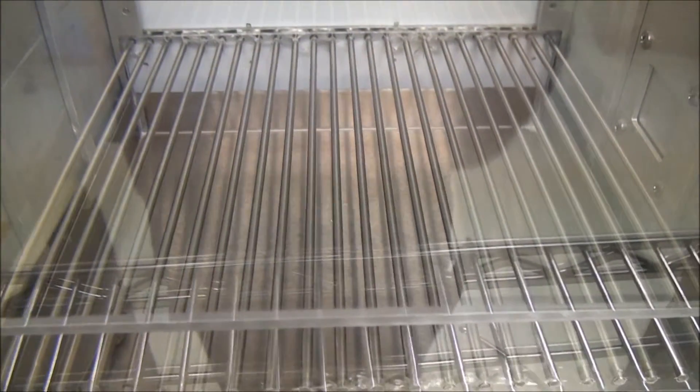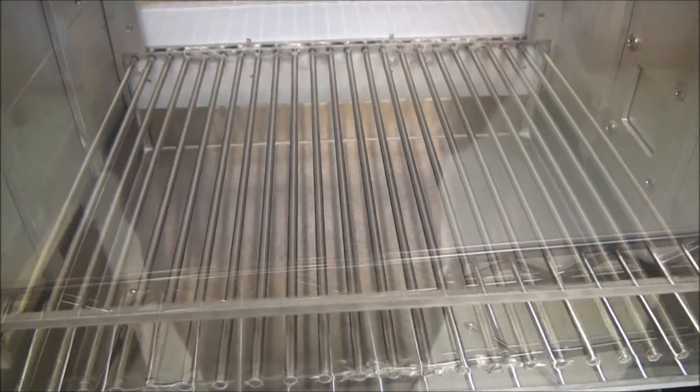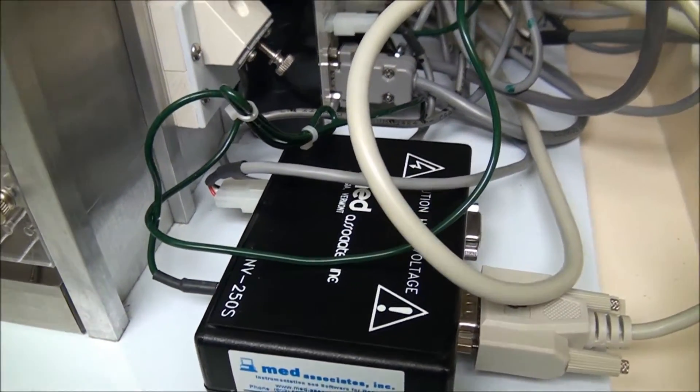And then you can see the gridded floor. This is a stimulus floor, so it does put out shock. And then this one is also unique because it's set up to be run two different ways.